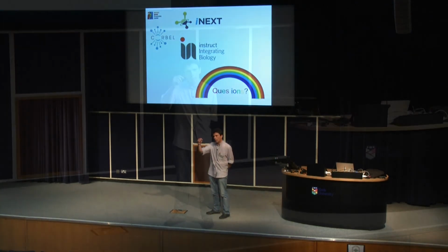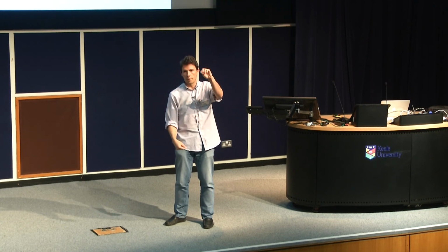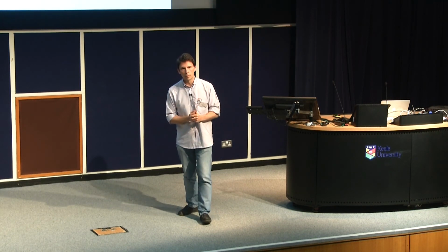Yeah, I would say visual inspection is one check, but you should put monitoring checks at all the points in your pipeline. So don't go blindly from the beginning to the end, applying all these steps, because this is the recipe to get the structure, but you should verify all the steps in between. Visual inspection is one of them.